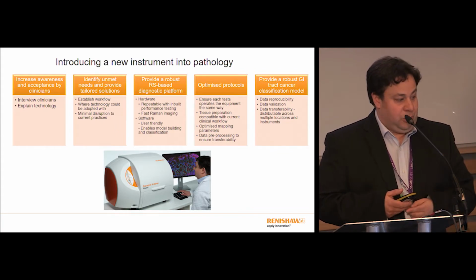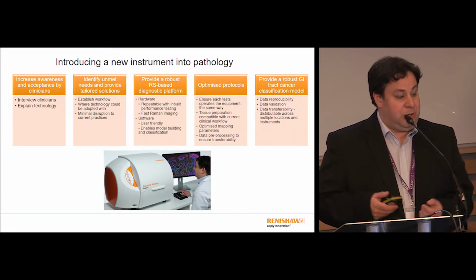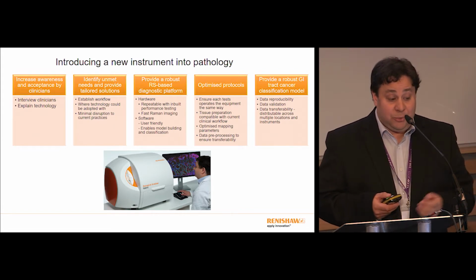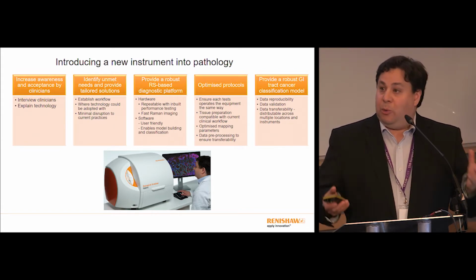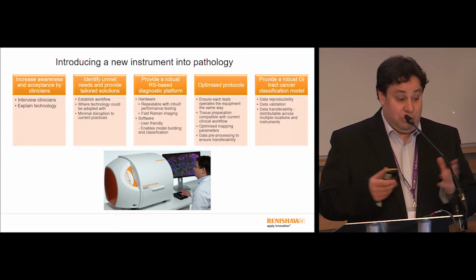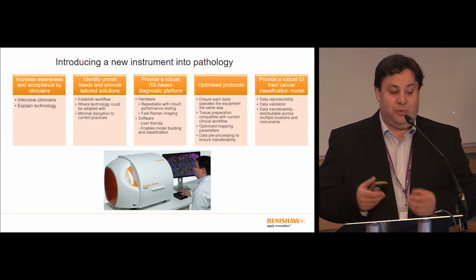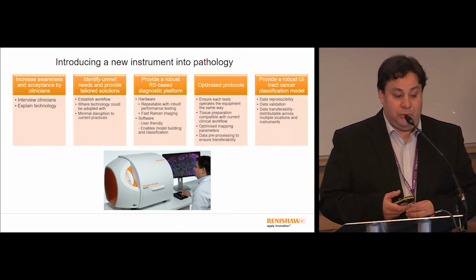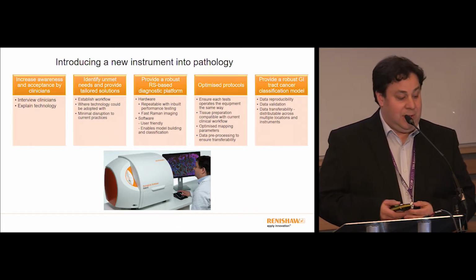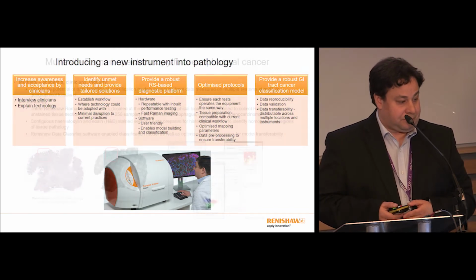We talked to clinicians, understood what their unmet need is, and tried to establish their workflow and how Raman spectroscopy could be integrated. We developed the software and hardware. We tried to optimize the protocols with the pathologists and the histotechnicians to provide the best quality. With this data, we then developed software that interrogated data reproducibility, validation, and transferability. And this is the machine that we've developed.